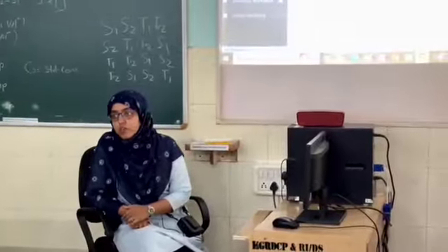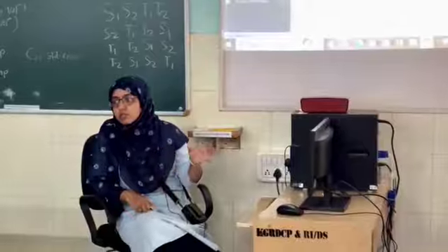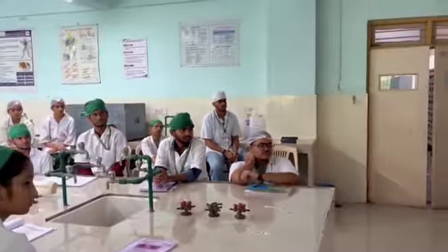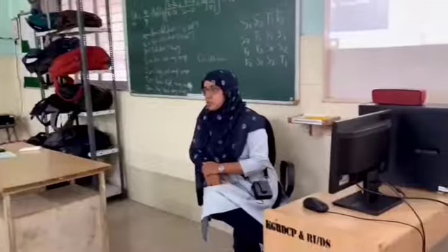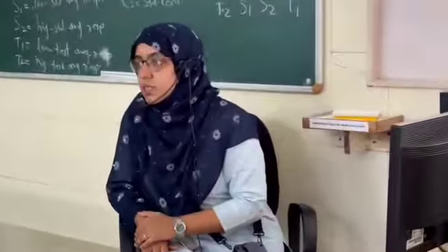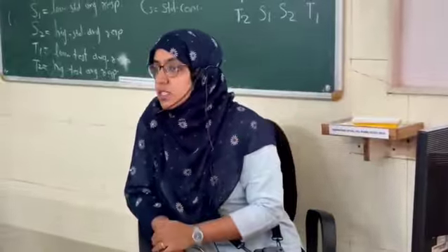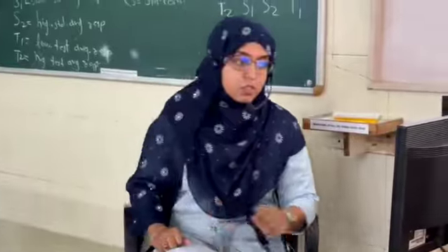So first of all, tell me why we use this type of software for preclinical screening. Because we cannot sacrifice animals for every practical activity. Just for practice purposes, we cannot sacrifice the animals. So we are using these simulation-based experiments, and this software mimics the role of animals in the experiments. We will do one experiment here and see how it works.